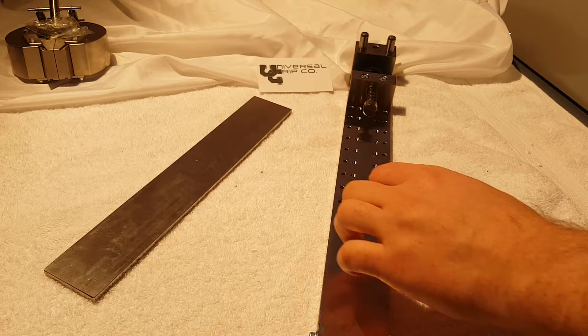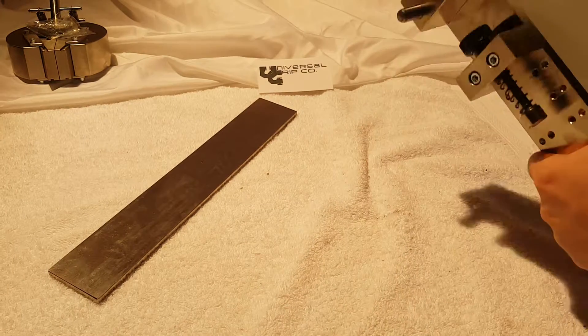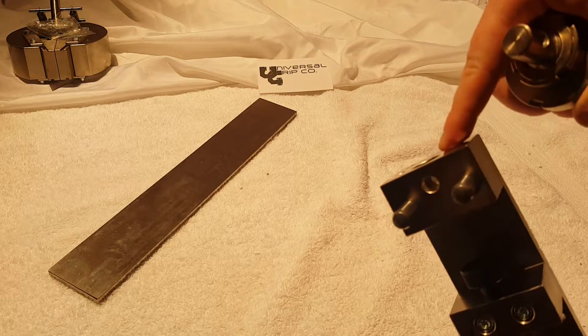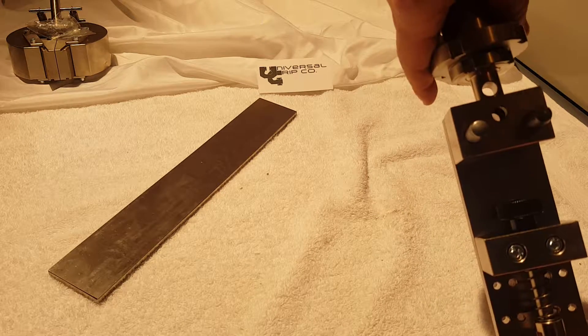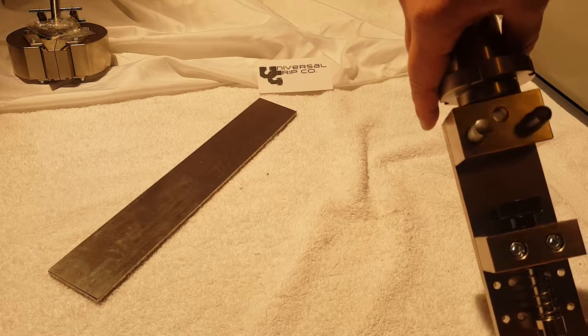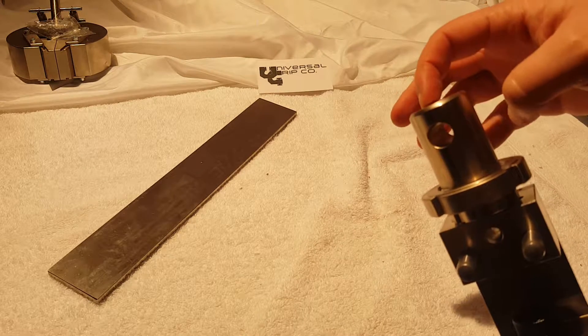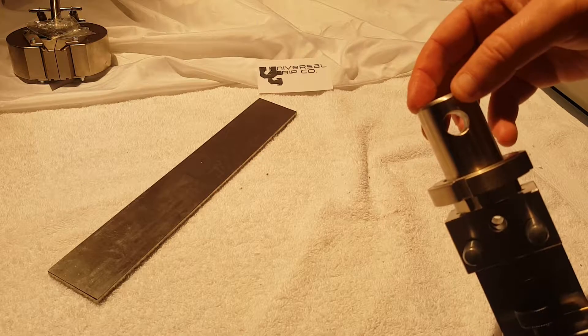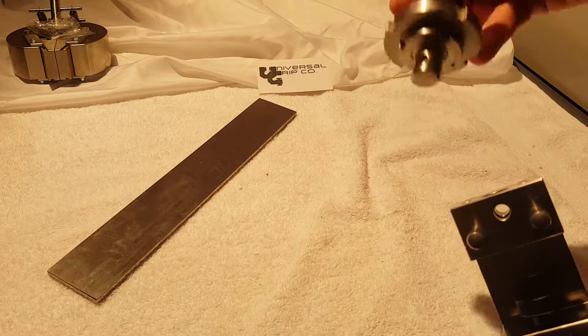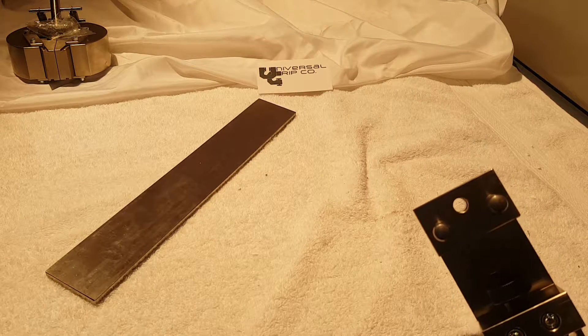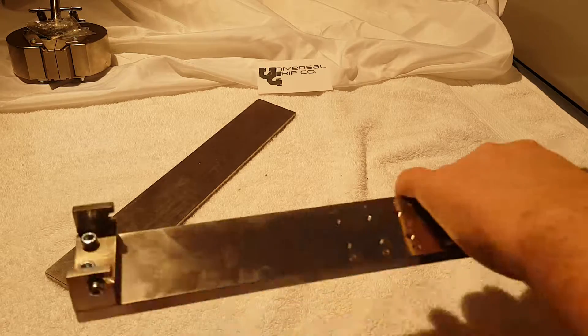This attaches to the machine via a female clevis pin adapter. We can use an adapter, throw it right in there, slide the locking pin through, and then this would attach up into most any universal testing machine or tensile testing machine out there. This is compatible with pretty much any system.